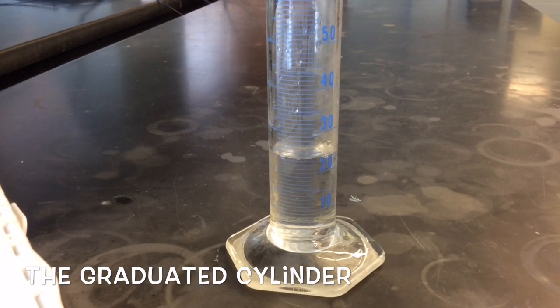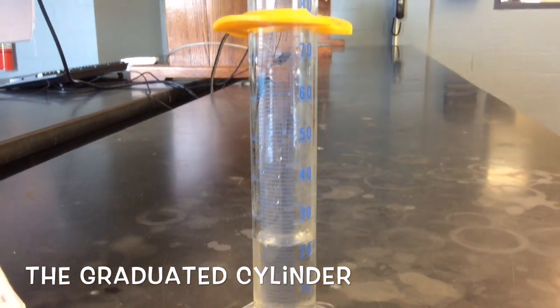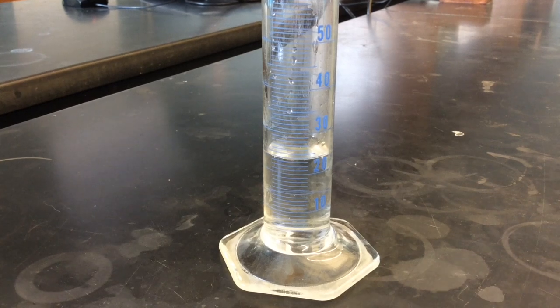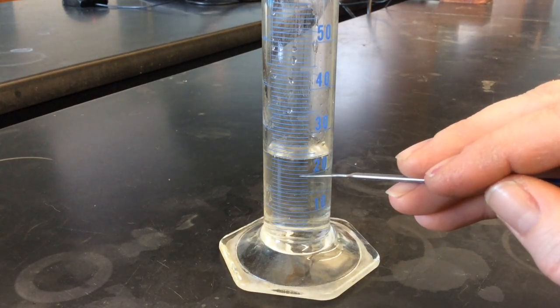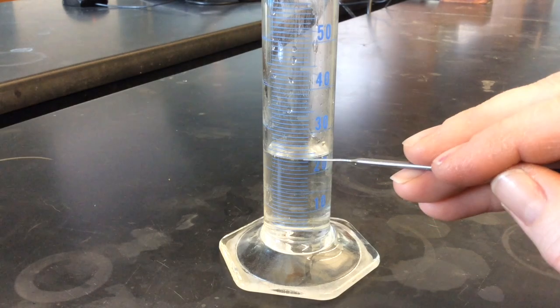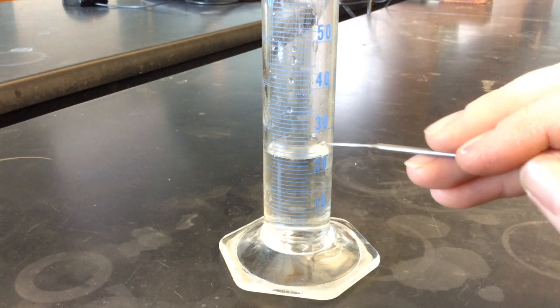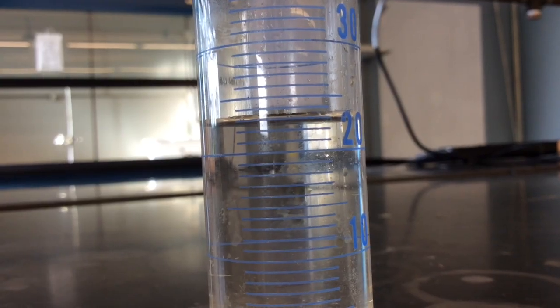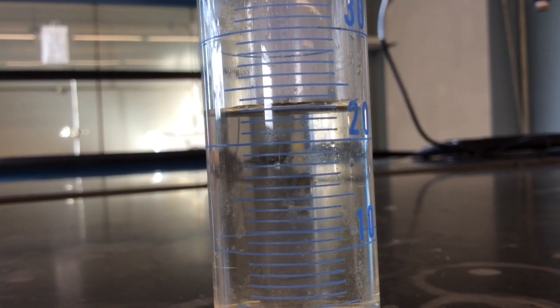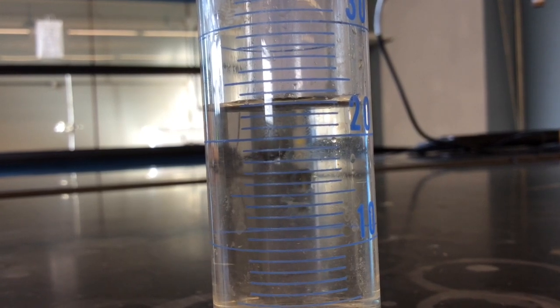The next piece of glassware I'd like to discuss is the graduated cylinder. In lab, you'll be working with a 100 milliliter graduated cylinder. The graduated cylinder has volume markings every 1 milliliter. So here there's a volume marking at 20, then 21, 22, 23, 24, 25 milliliters, 26, 27, 28, 29, and 30 milliliters. Because the graduated cylinder has markings every 1 milliliter, the precision of the graduated cylinder is in the tenths place, so the graduated cylinder can be read to 1 decimal place.